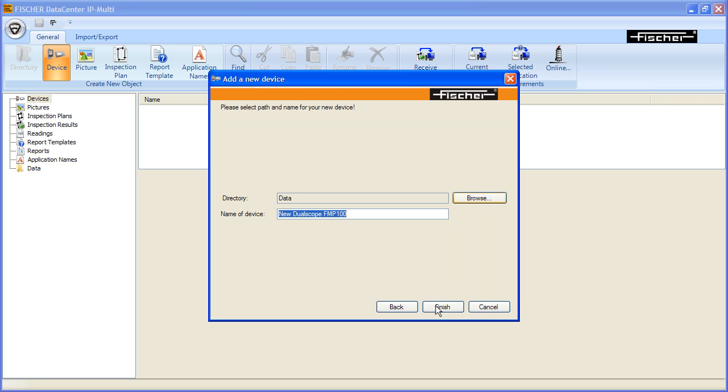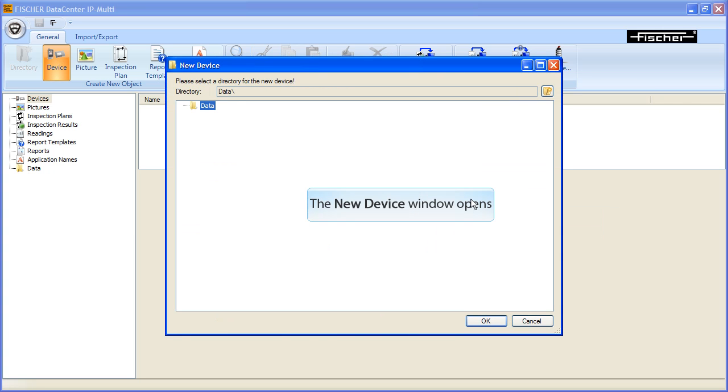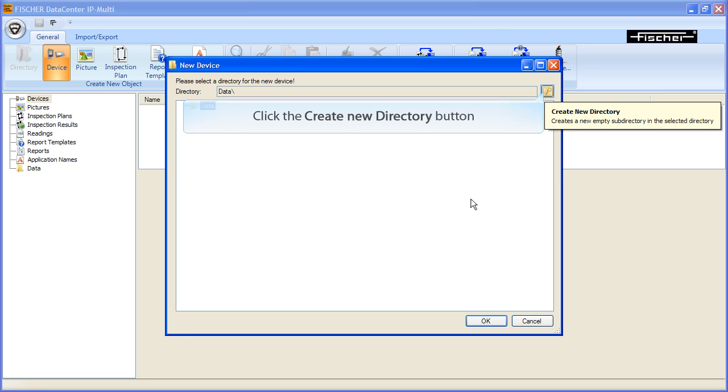A query for the memory location for the device settings appears. Now click Browse to specify a new memory location. To create a new folder below data, click the Create New Directory button.